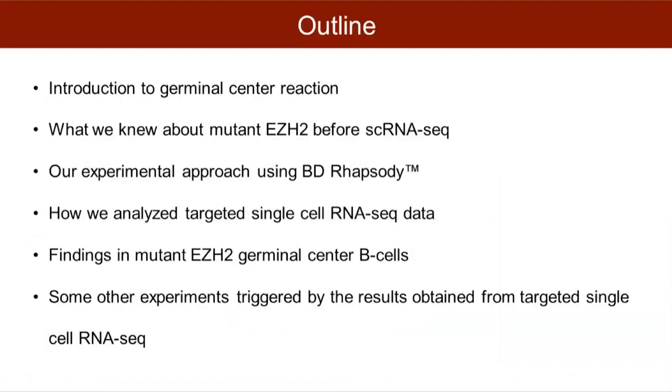This is the outline of the seminar. I'll give you a brief introduction to the germinal center reaction and the role of the enzyme EZH2. I'll show you what we knew about mutant EZH2 before performing single-cell RNA-seq, our experimental approach using BD Rhapsody, how we analyzed our targeted single-cell RNA-seq data, our findings in mutant EZH2 germinal center B cells, and finally, some other experiments that were triggered by the results obtained from targeted single-cell RNA-seq.